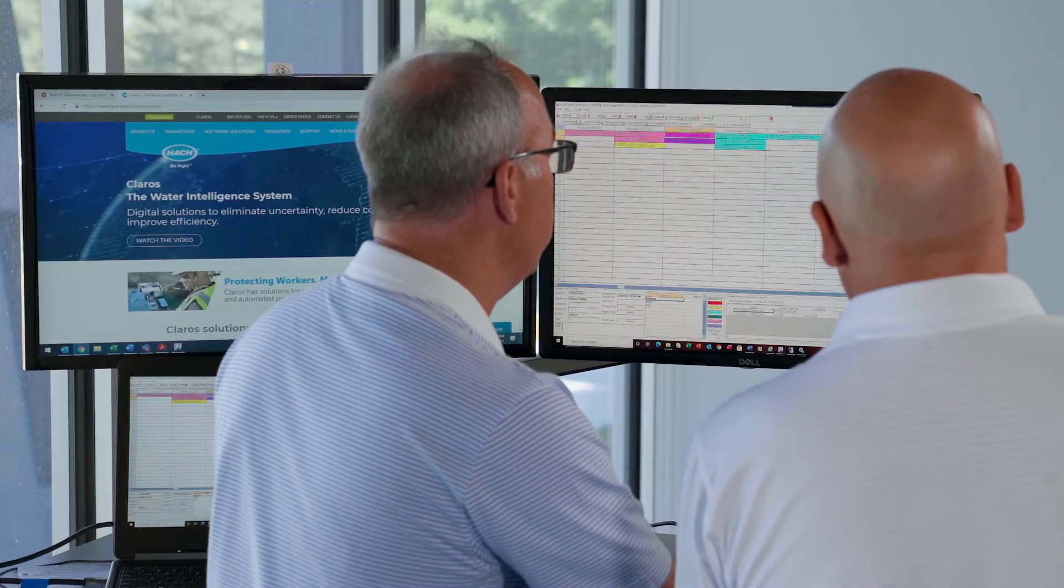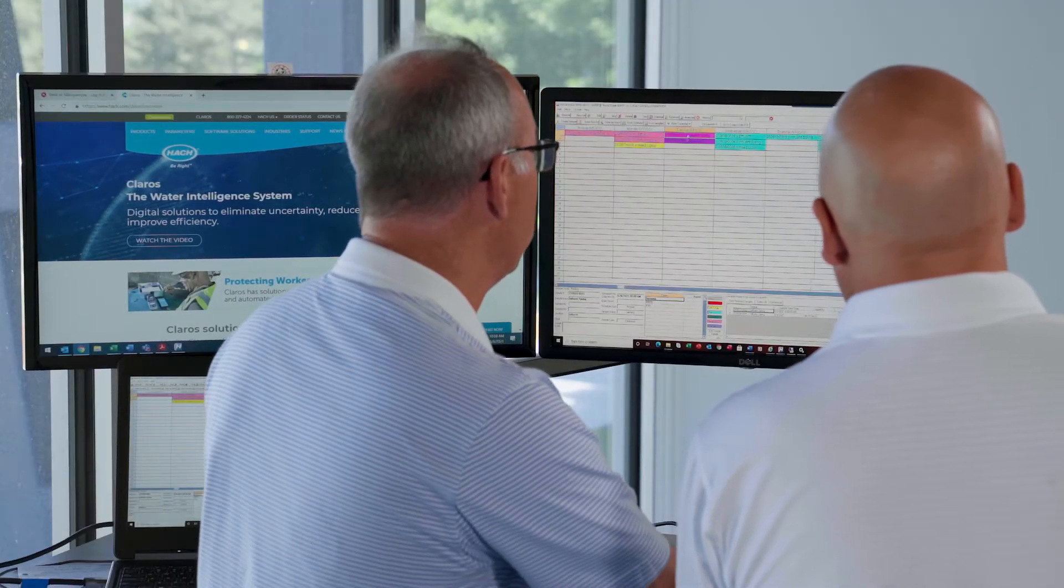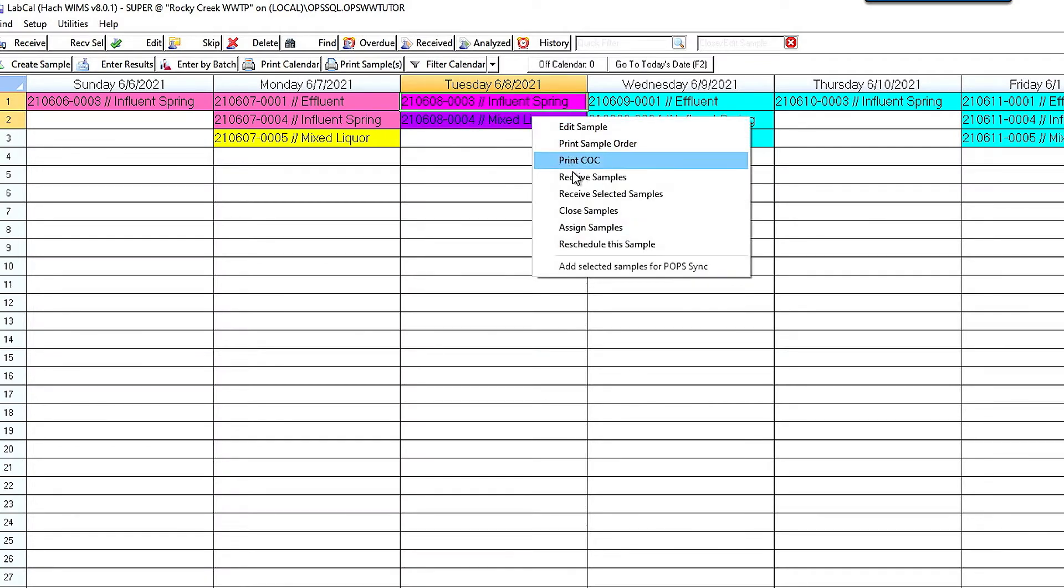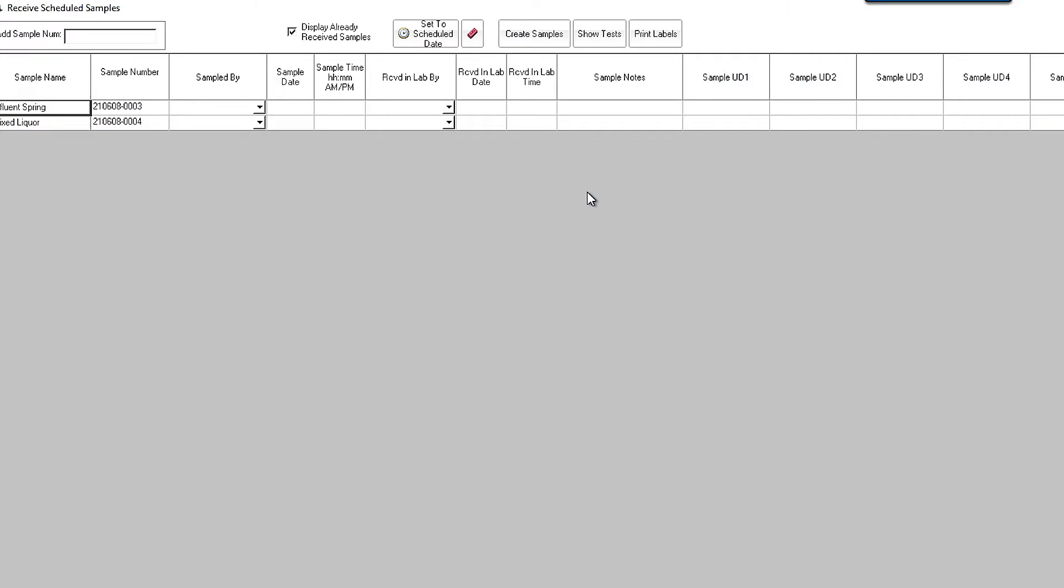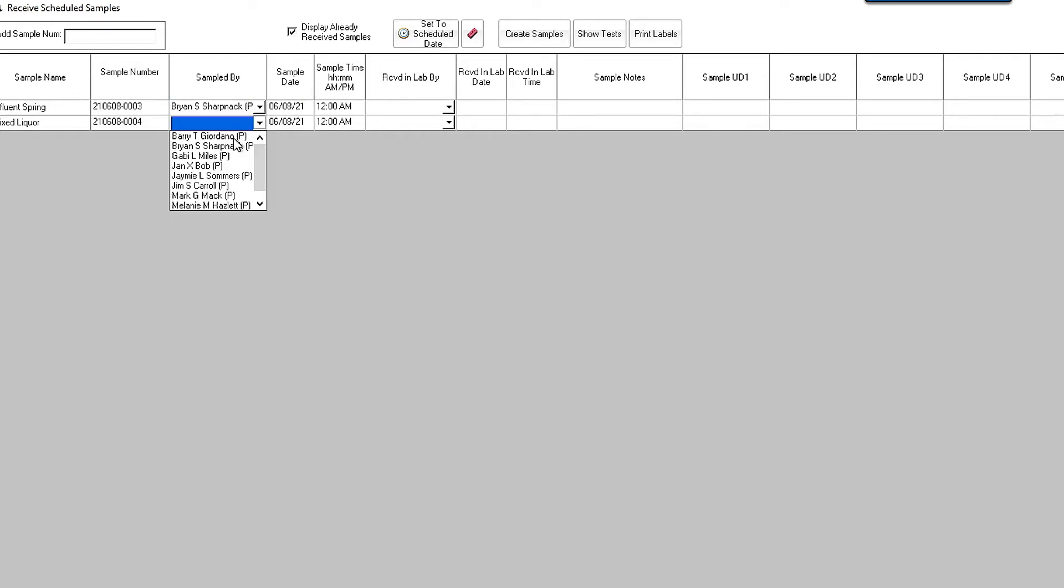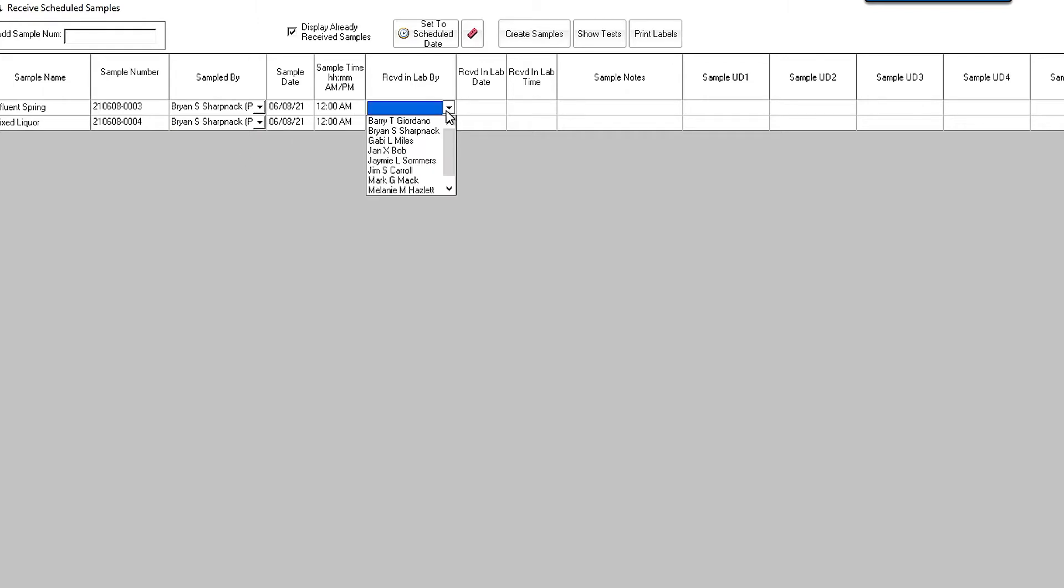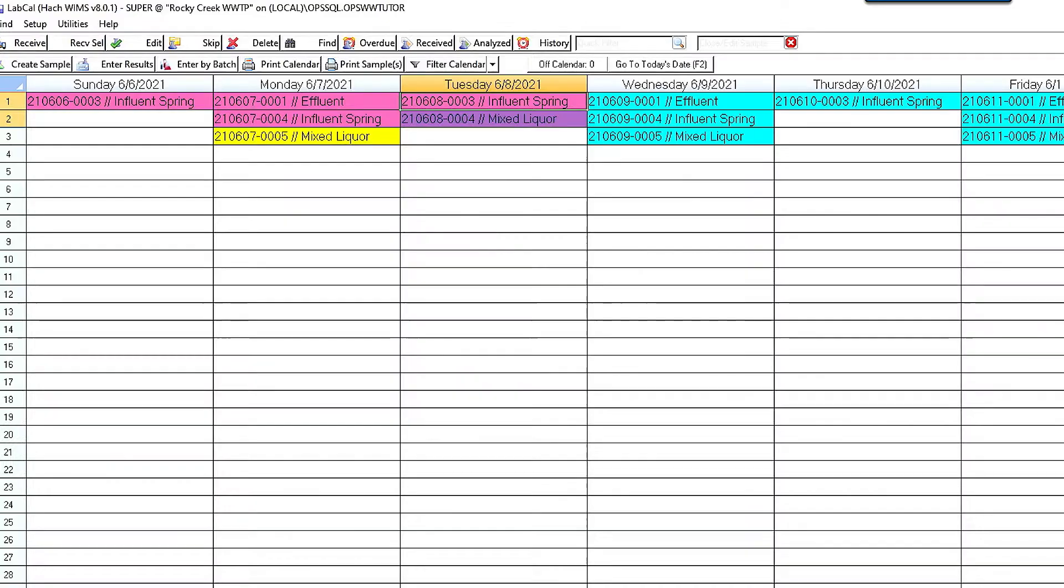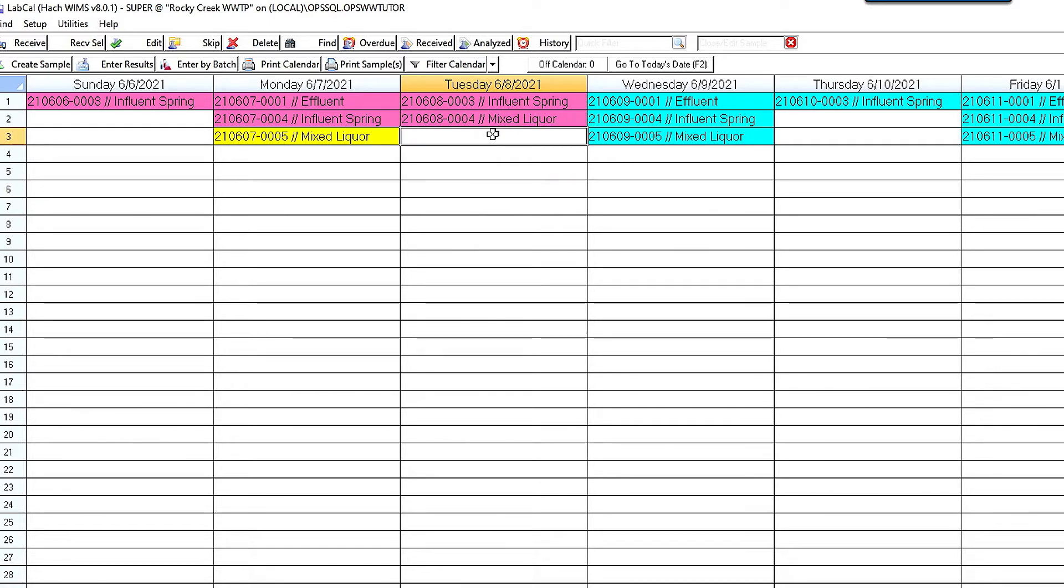So the other thing we can do after that is so we print the chain of custody. You go out and take the samples. The next thing you're going to do is I'm going to highlight those samples, and I'm going to receive those samples in. So in here I can come in and I'm going to enter in my sample information. So I'm just going to say it was sampled by Mr. Sharpneck. That's you. And I can also specify who received it in the lab. Now I'm going to save those changes. And those samples are marked as now pink, meaning they're received in the lab.